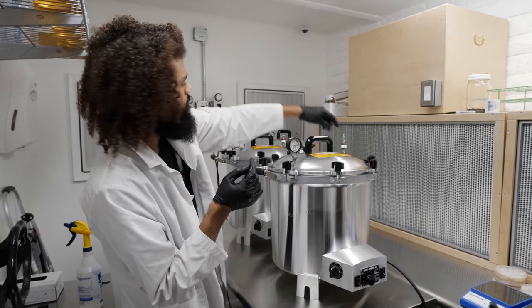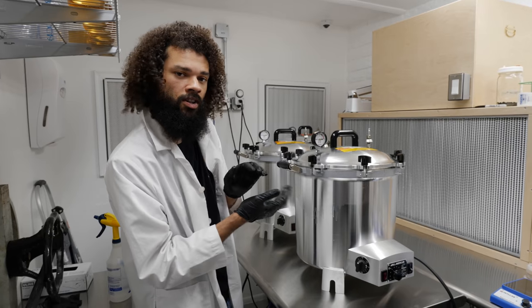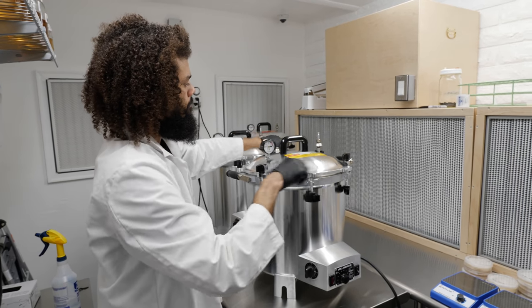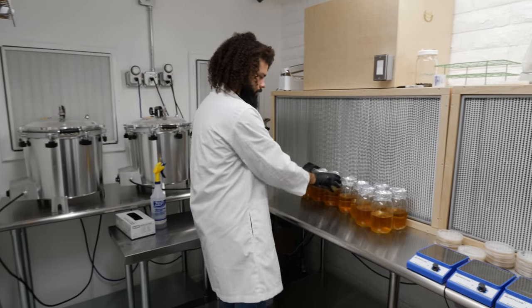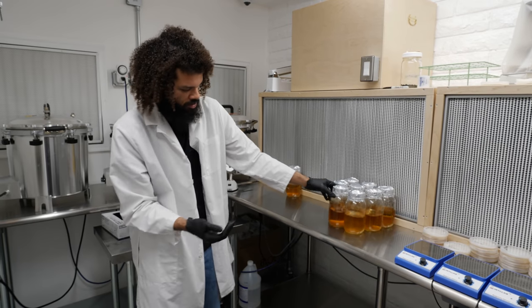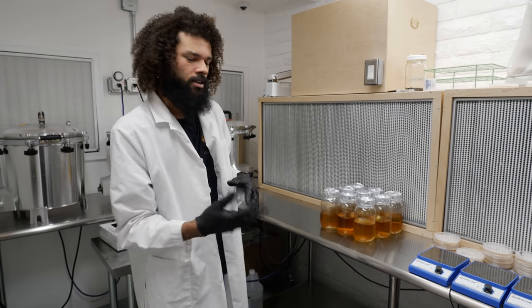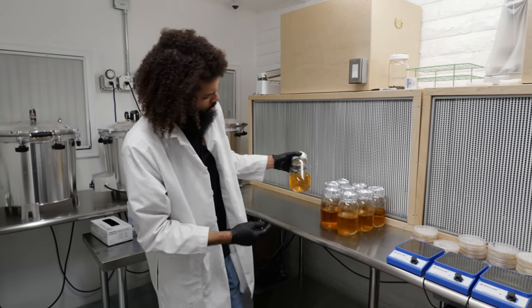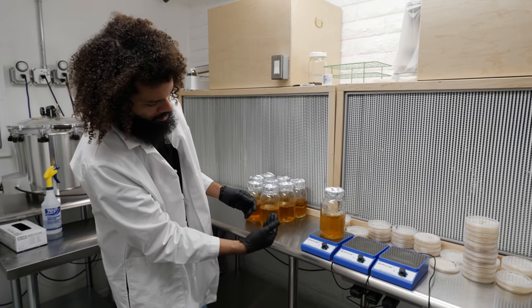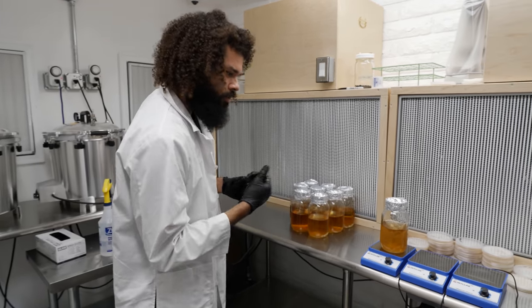So we'll just depressurize the chambers — that just escapes any built-up pressure inside of our sterilizers. In these jars we have 500 milliliters of our liquid media, so it's just a nutritive liquid broth that we can use to expand out the mycelium. Each jar is equipped with a magnetic stir bar so we can use that to agitate the mycelium and break it up, allowing it to be drawn into a syringe.